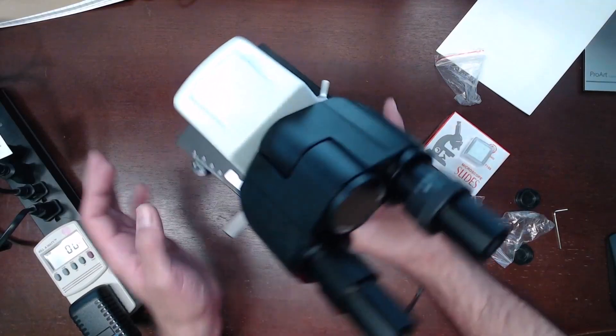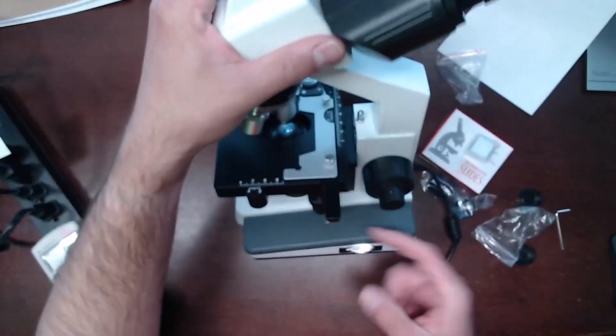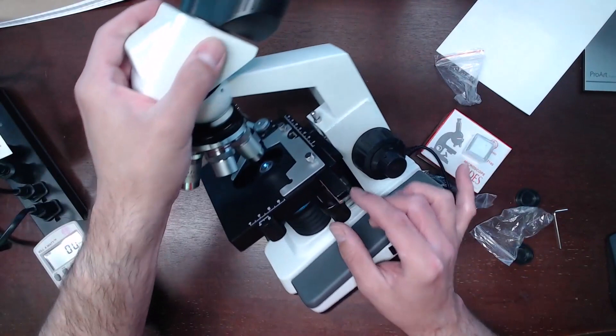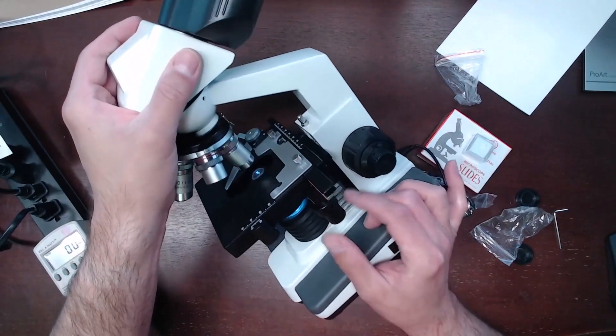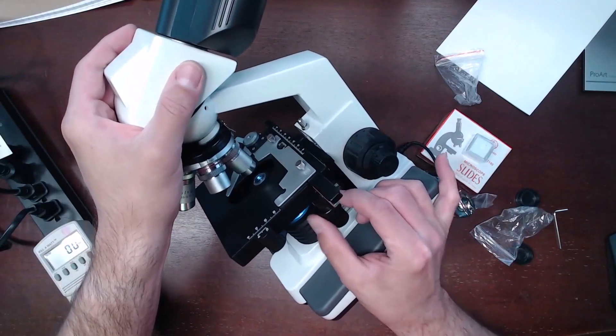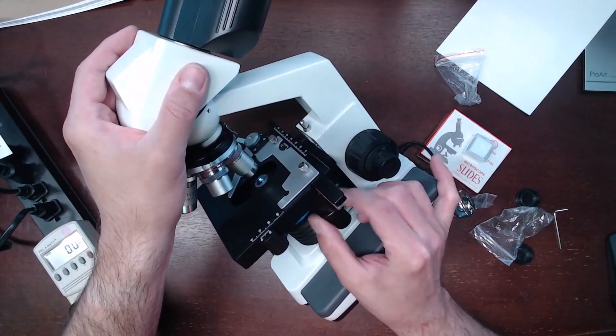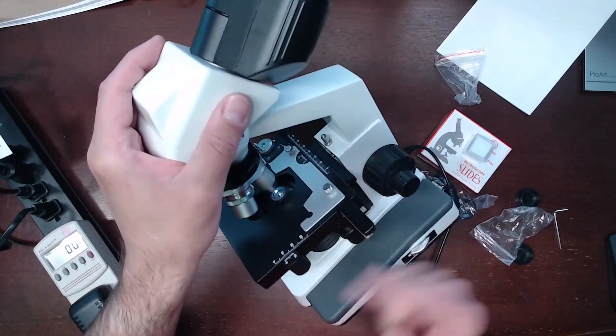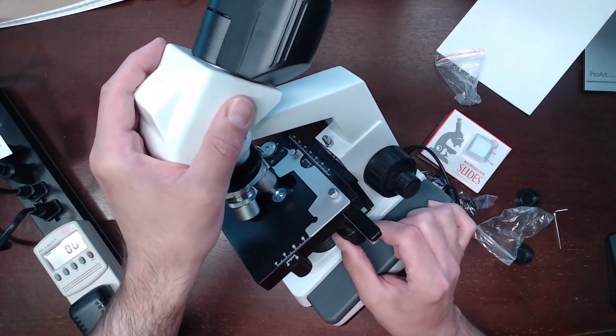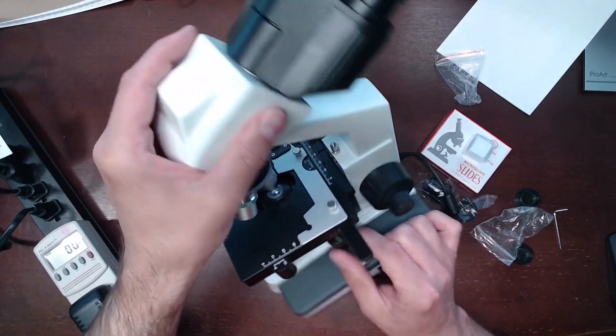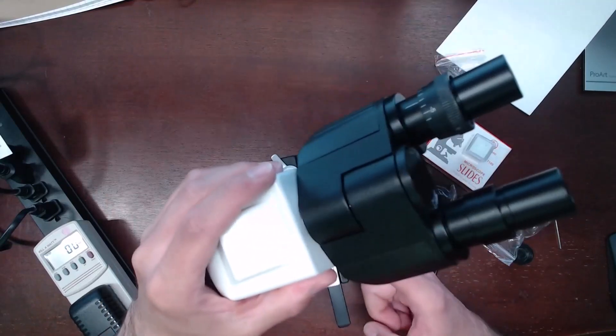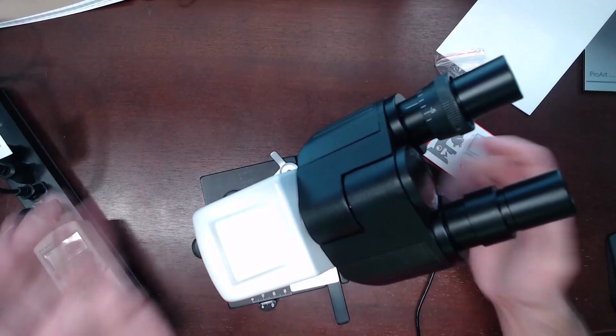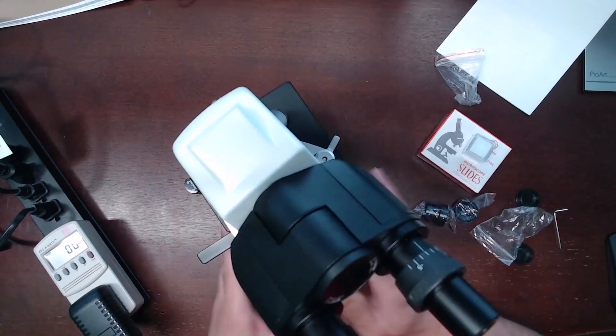On the other side, on the left-hand side of the microscope, you do have another set of two gears here. There's the top ring that sticks out more, moves the stage in one direction, and then the bottom knob will slide the slide holder left and right. It works very well. I've got no real complaints on this.